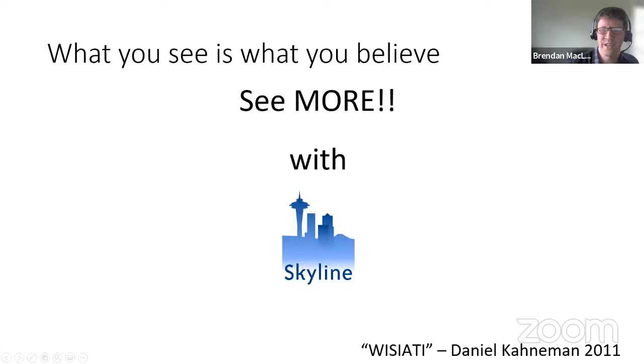Based on a book by Daniel Kahneman, a Nobel Prize winning psychologist, who had this idea called WYSIATI, what you see is all there is, I changed that to: what you see is what you believe. If you see stuff at only a very high level, you'll make up stories and you might be wrong. So we encourage you to use Skyline to see as deeply as you can into your data before you publish. We recently got an email from somebody who said they were so glad they put the data through Skyline. They were using another tool, ran it through Skyline, and realized that the conclusions they were making were not correct.